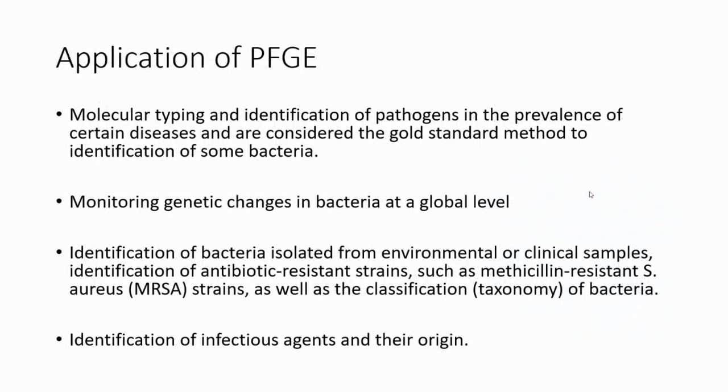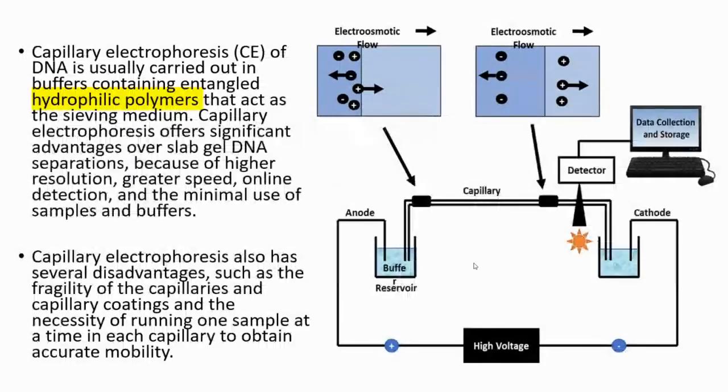So the applications, for example, are the identification of bacteria isolated from an environmental or clinical sample, and identification of the MRSA strain. So all these are applications for PFG. And then another topic is called capillary electrophoresis.